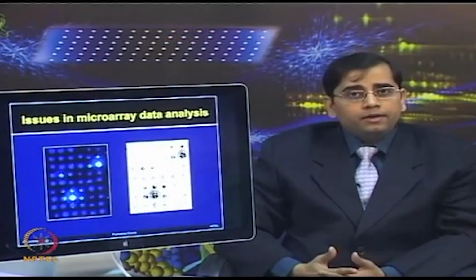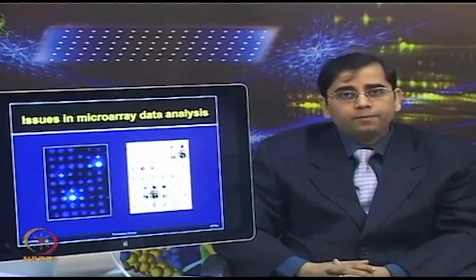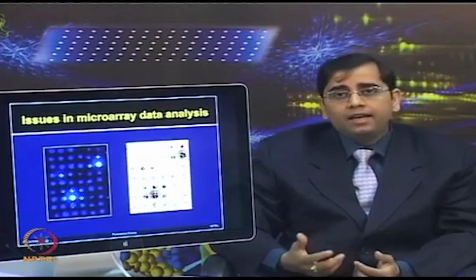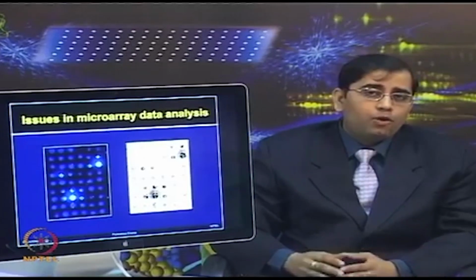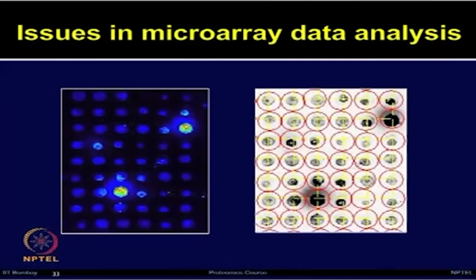Scaling up is a good approach because one wants to perform high throughput experiments so that thousands of features can be studied simultaneously. However, while scaling up, especially when you are using cell-free expression based approaches, one needs to be cautious about the optimum density for these arrays, because if there is a spillover of expressed protein onto the neighboring spot, that is going to affect the values for the neighboring spot.